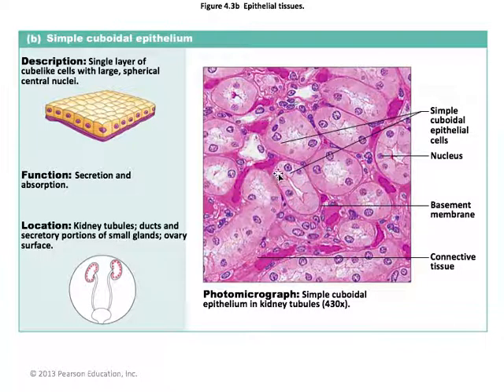You're not always going to catch all of the nuclei. So here you have probably 1, 2, 3, 4, 5, 6, 7, 8, 9 cells. Only 3 of their nuclei are showing because when they did the histological slice here, it did not cut all of the nuclei. It only cut the nuclei of these 3 cells. Hopefully that makes sense.